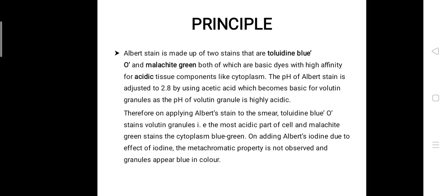To use this Albert staining solution, each of the two solutions must be prepared effectively with the right percentage, or you can buy it, as it is commercially available. So these two solutions are needed in order to demonstrate the granules with the right color after staining. Albert staining solution 1 acts as the staining solution, while Albert's solution 2 acts as the mordant, that is an ion element that binds and holds a chemical dye to make it stick on the microorganism.